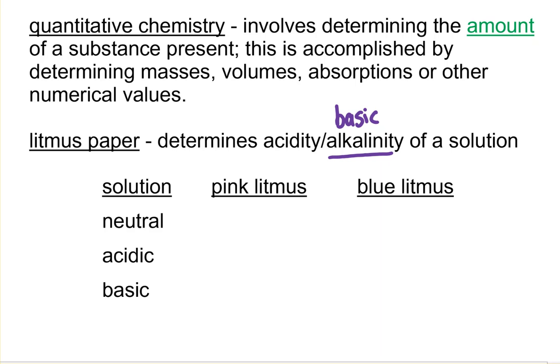Okay, so starting with a neutral solution, if you dip pink litmus paper into it, there'll be no change. I'm going to use NC for no change. If you put blue litmus in a neutral solution, you will see no color change there as well.